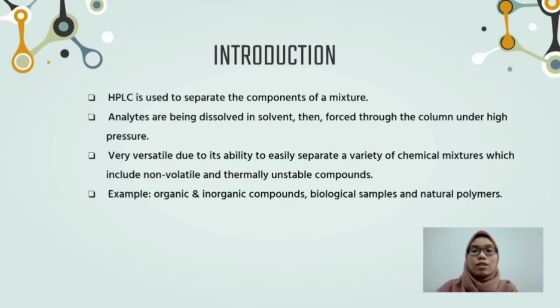Next, HPLC is very versatile due to its ability to easily separate a variety of chemical mixtures, which include non-volatile and thermally unstable compounds. For example, organic and inorganic compounds, natural polymers, biological samples, and others.